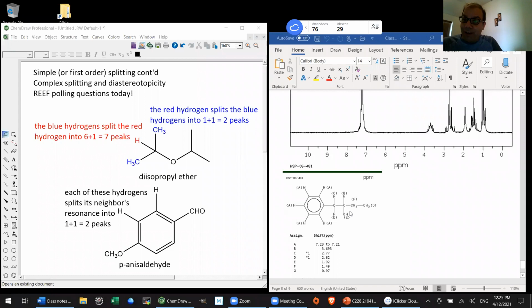Same thing is true of carboxylic acid protons, except they can't be absolutely anywhere. They're going to be quite far downfield. But I would say anything in the 10 or 11 to 15 or even 16 range is fair game for a carboxylic acid proton. And a similar thing happens with NH protons in primary and secondary amines. They can be anywhere and they can be stupidly broad. I've had cases where I had to integrate over like 3, 4, 5 parts per million to find my one NH proton somewhere in there. So they can be very difficult to identify, and they can also be just about anywhere.